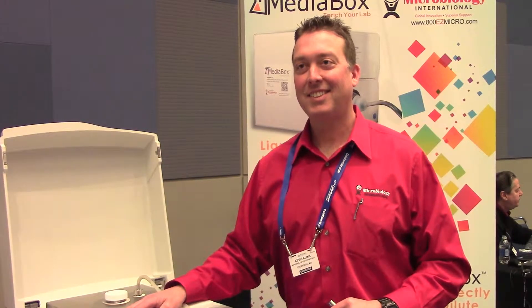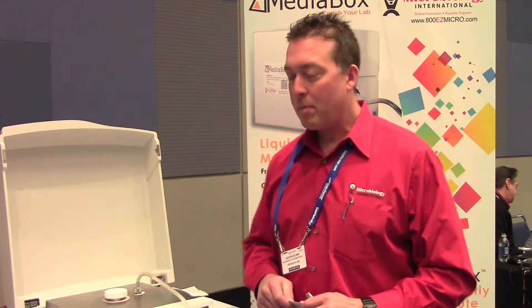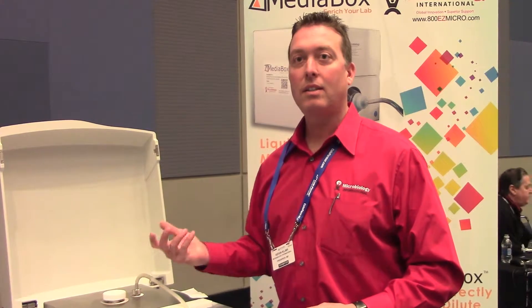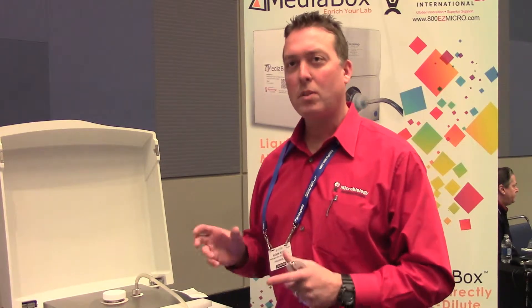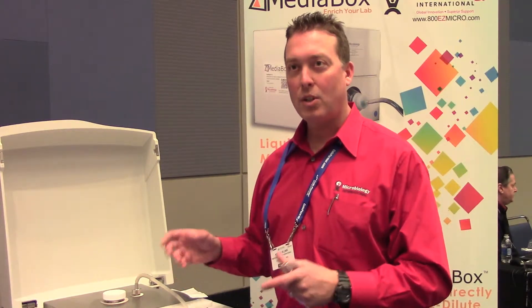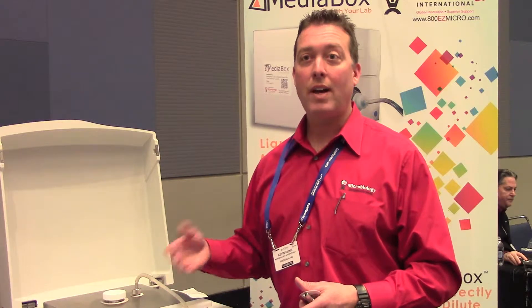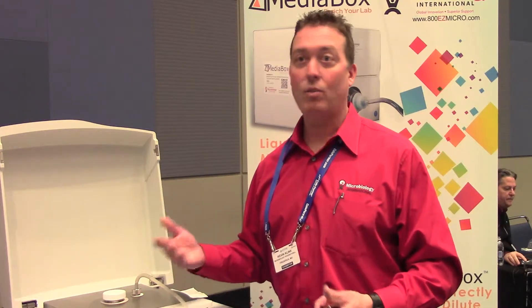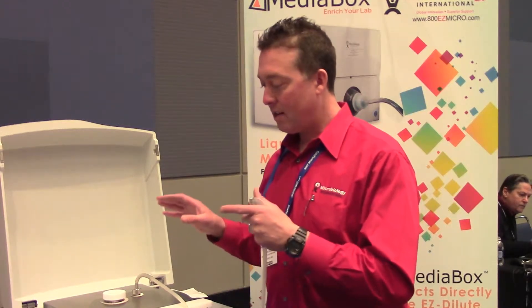Kevin, thanks a lot for that overview. But as a lab manager, why would I want to use a media preparator over an autoclave? That's a great question, actually. The media preparators are dedicated to autoclaving liquids. They're constantly homogenizing the sample and preparing the media. With an autoclave, you have to fill and homogenize multiple flasks — 500 ml, 1 liter, 2 liter flasks — and prepare the media on the bench. It's a messy process. A lot of the older autoclaves don't have the ability to measure the liquid temperature, so they're not actually performing the process of autoclaving correctly. Here we can dedicate all of that to liquids and media preparation in a very solid fashion.